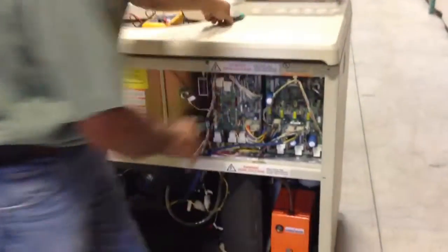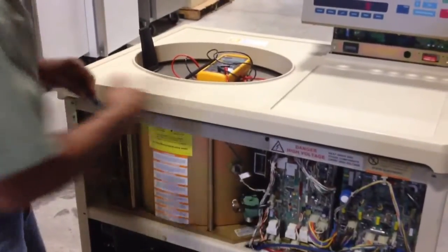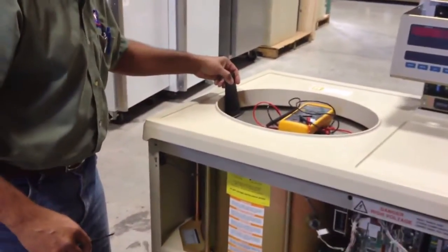Now we need to get this lid off — this top cover off. To get this top cover off, I need to slightly open this chamber lid.